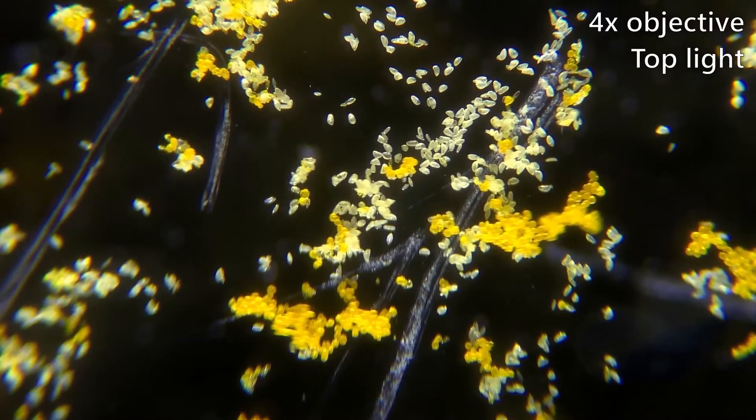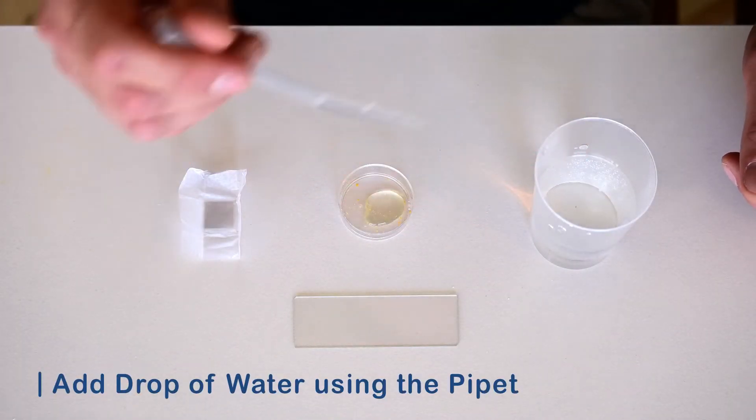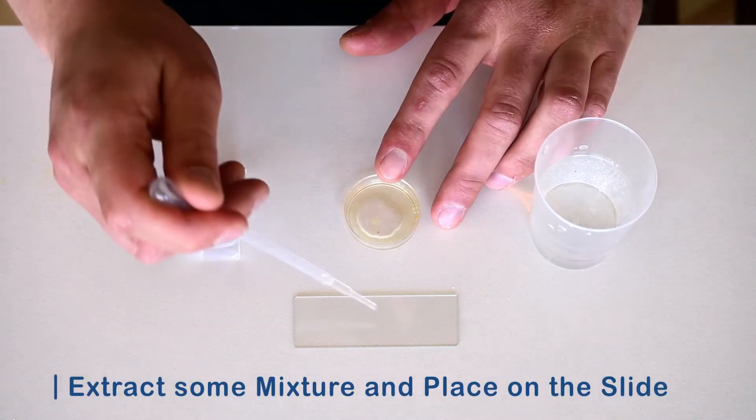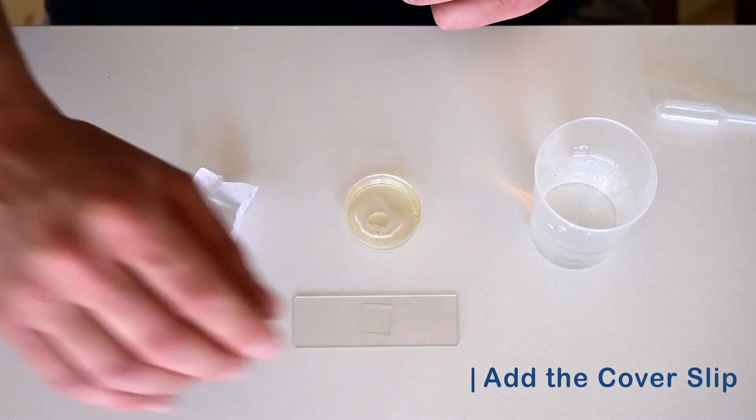If you want to have a closer look, add some of the pollen to a blank slide. You can either just tap the petri dish over the slide, or add a bit of water to the dish and extract a drop of pollen water with the pipette. Place the drop on a glass slide and add a cover slip.